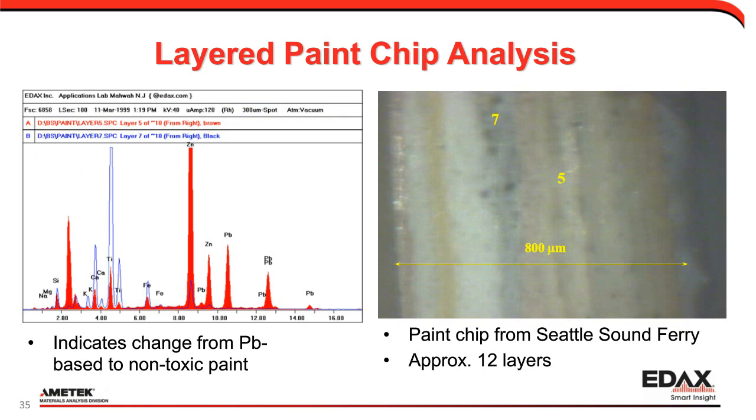This is an example using the Orbis XRF system to analyze paints and paint chips. Paint contains a lot of inorganic additives, and the composition of those inorganic additives might depend both on time. So paints used years ago might contain lead oxides in them, whereas paints used today probably would be some sort of lead-free formulation.